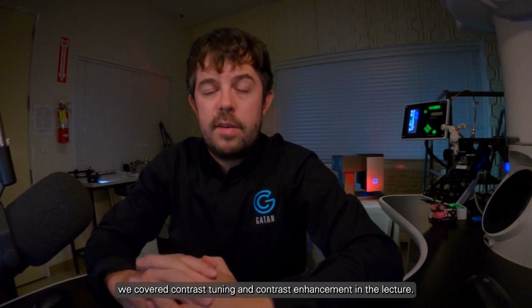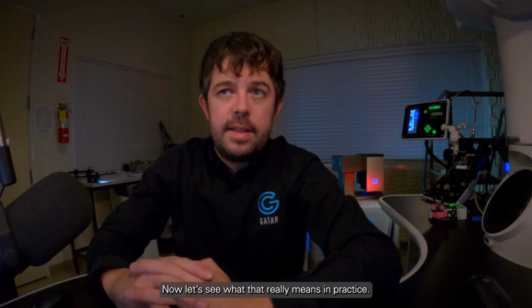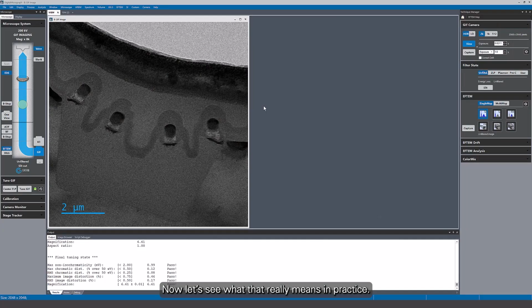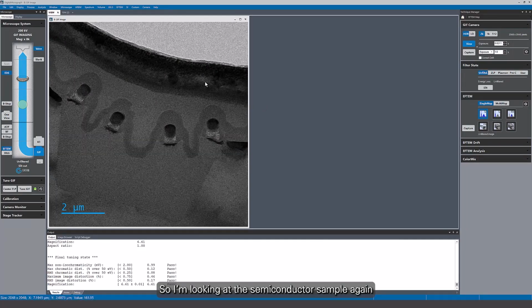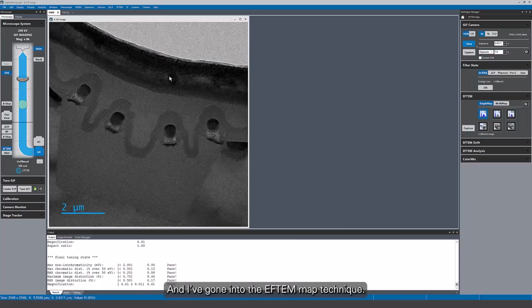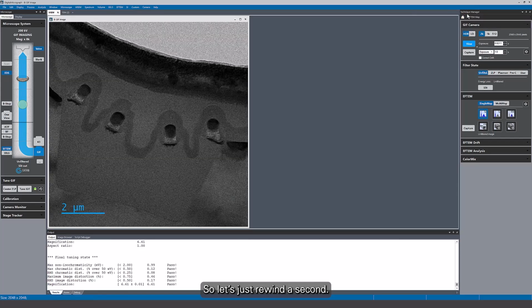Okay, so we covered contrast tuning and contrast enhancement in the lecture. Now let's see what that really means in practice. So I'm looking at the semiconductor sample again, the device that we saw in some of the previous lessons. And I've gone into the EFTEM map technique. So let's just rewind a second.